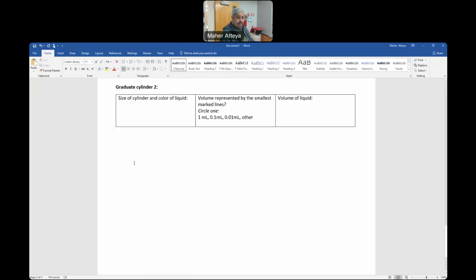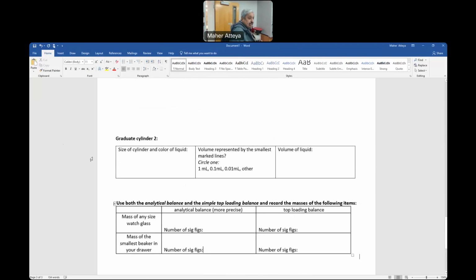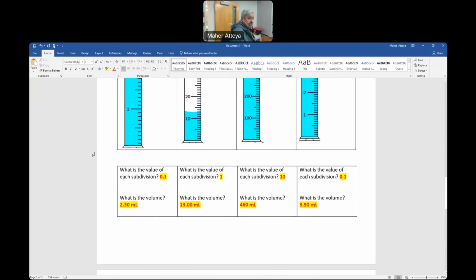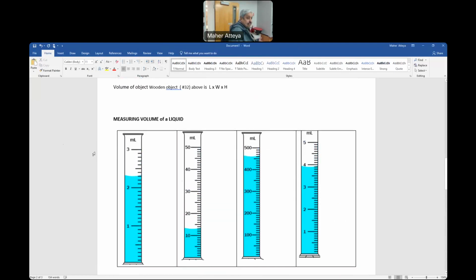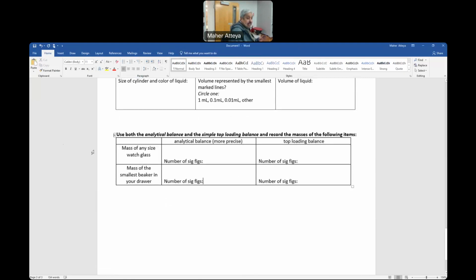That's the mass. This is your procedure. Then we come to the discussion. Discussion is how you did. You did very well, because you can still say that my last digit estimation might be off, depending on my reading. Otherwise, all my readings are correct to the best of my ability.